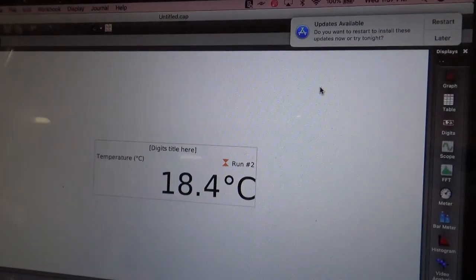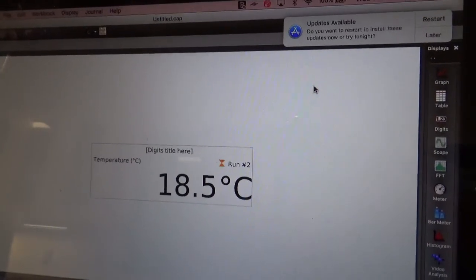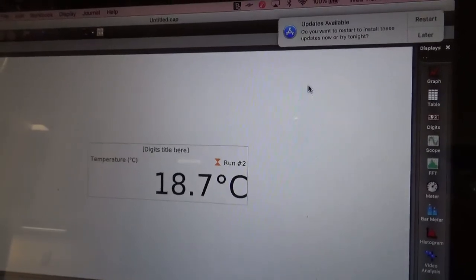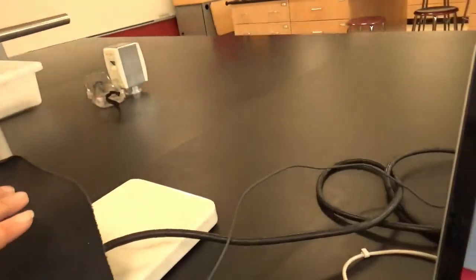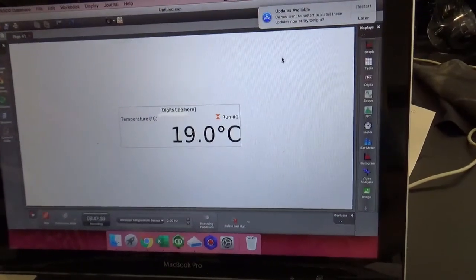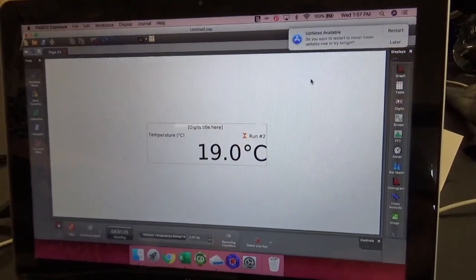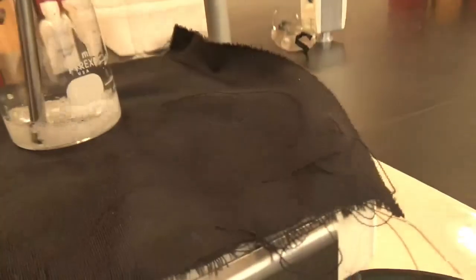Actually, I'm going to put some black paper or black cloth so we can see how the dissolving is going. Unfortunately, I got to raise this up a little. That's going up quite fast. Well, that's because I took it out for a minute. You see, now you can really see how cloudy it is. Oh, that's really good.